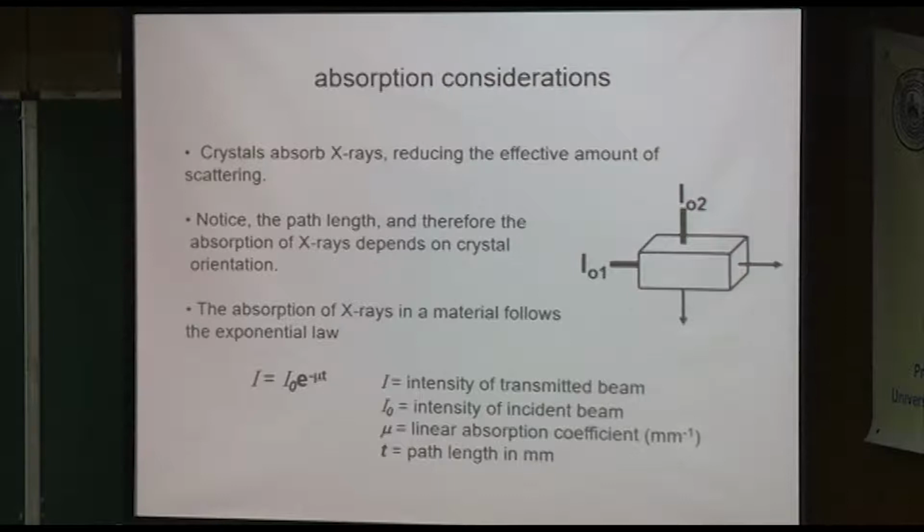Most crystals are not spheres, right? So some of them are long, skinny needles, and here's your mounting pin. If you mount the crystal like this, as a needle, when the path is this length, you're going to have a lot more absorption than when it's this length. So that's a consideration. People used to grind crystals. I've tried grinding them to spherical shapes. They usually shatter and they don't survive. So I think it's better to just try and mount them vertically if you can.